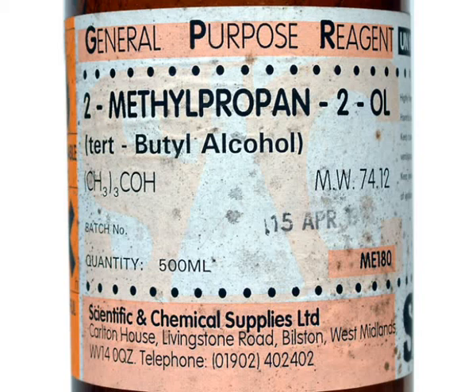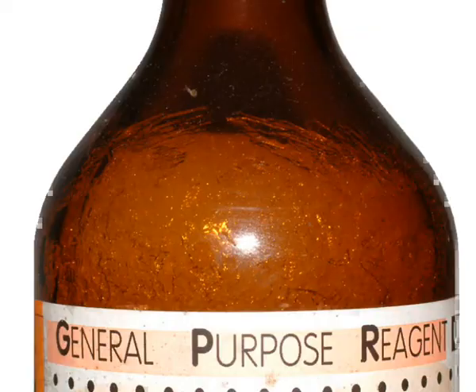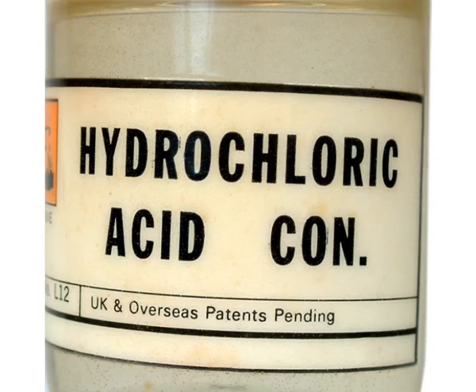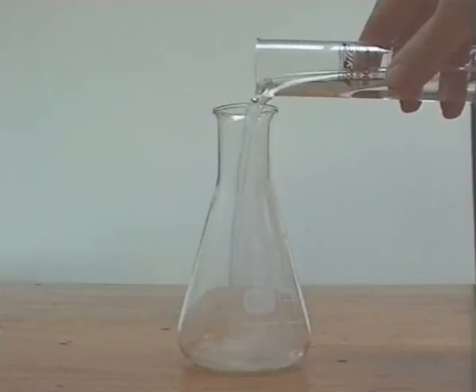The bottle of 2-methyl-propan-2-ol may need to be placed in some warm water as the contents often freeze in a cold store. 20 cubic centimetres was placed in a conical flask and 70 cubic centimetres of concentrated hydrochloric acid was added carefully.